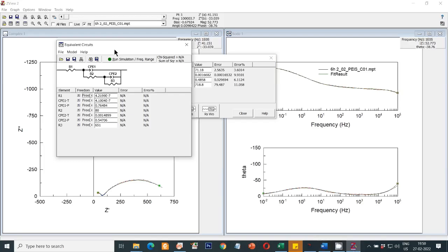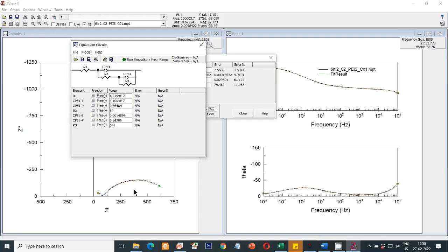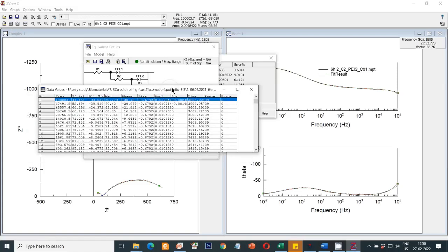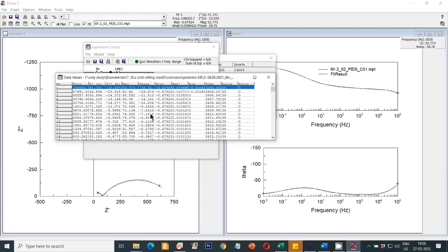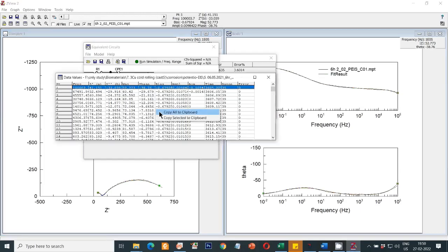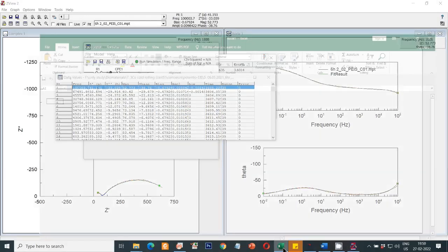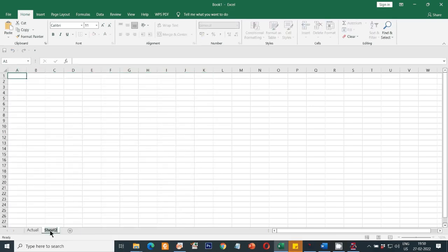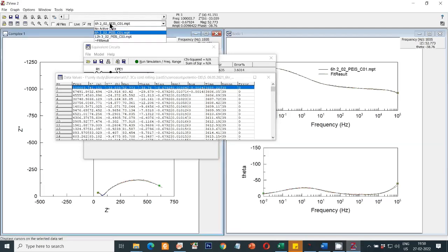To plot the Nyquist data in Origin, go to the Data Values option. You need values from both the actual graph and the fitted graph. First select the actual graph — six hours — then right-click and choose Copy All to Clipboard. Go to Excel and paste it; I'll rename the sheet to 'actual'. Then create another sheet named 'fit'. Go back to ZVUE and select the Fit Result option, then copy all to clipboard and paste into the 'fit' sheet in Excel.